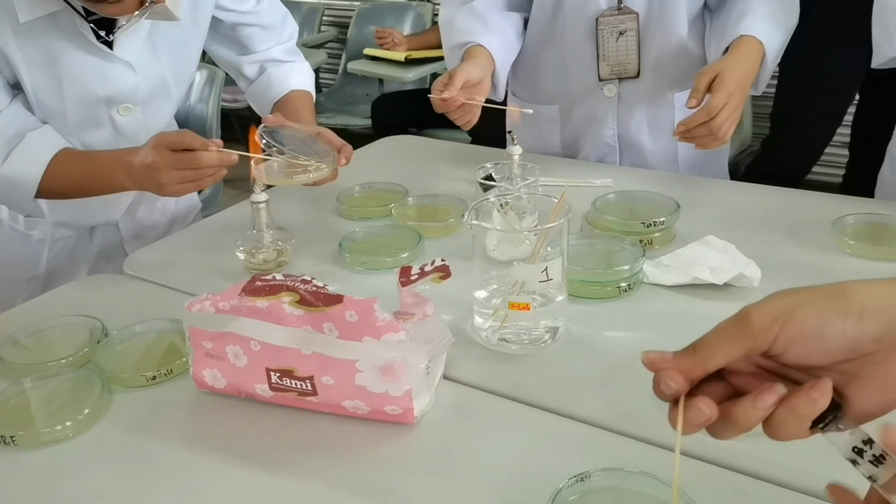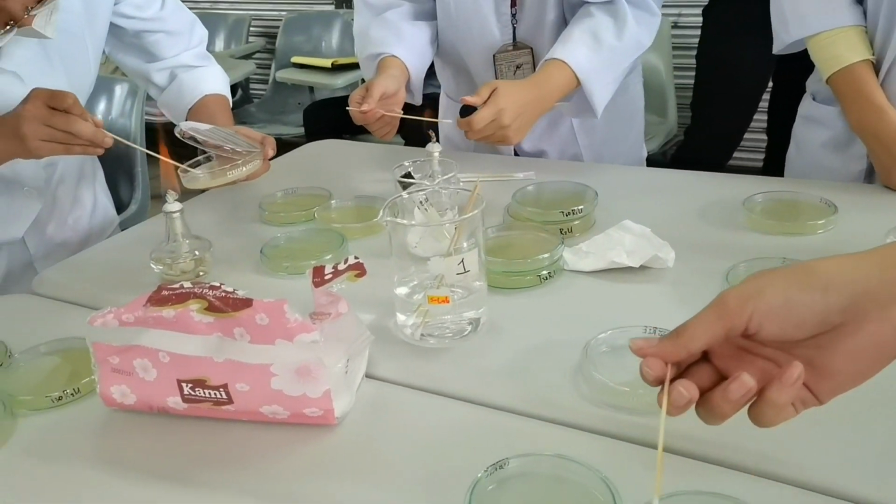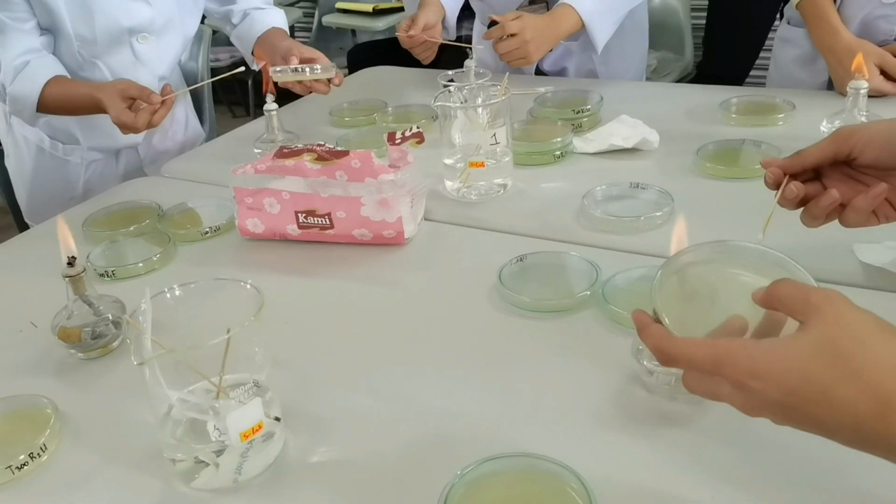For efficiency, they have split the plates into multiple inoculators.